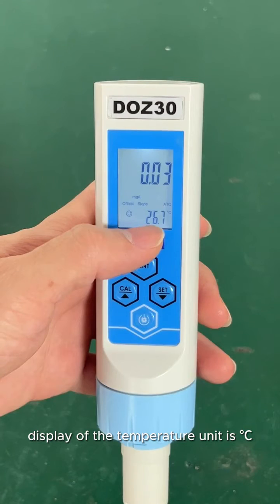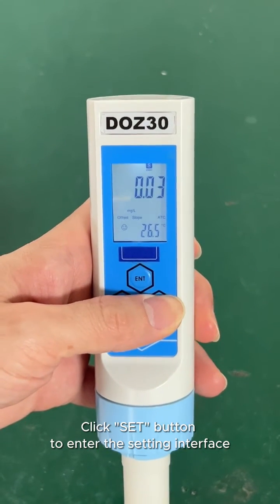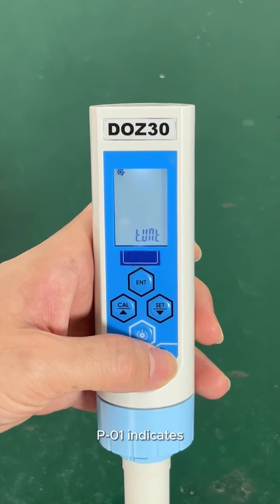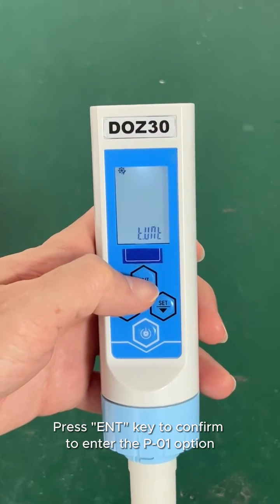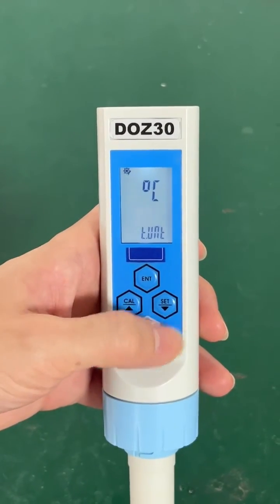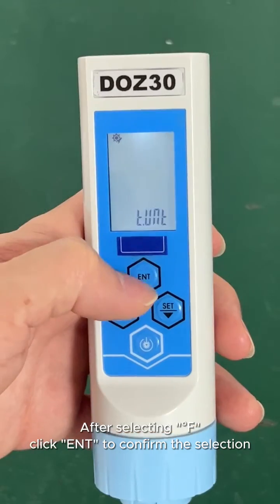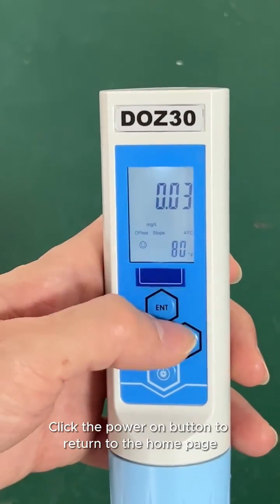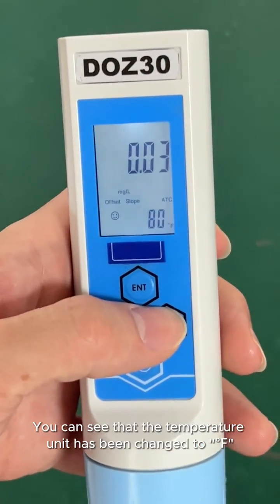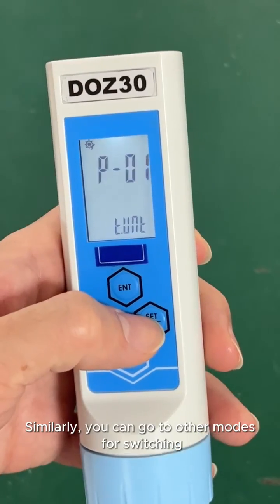In the lower right corner of the display, the temperature unit shows degrees Celsius. Click that button to enter the settings interface. P01 indicates the selection of temperature unit — press the confirm key to enter the P01 option. Press SET to select degrees Fahrenheit, then click confirm to save the selection. Press the power button to return to the home page; the temperature unit has now been changed to degrees Fahrenheit. Similarly, you can go to other modes for switching.